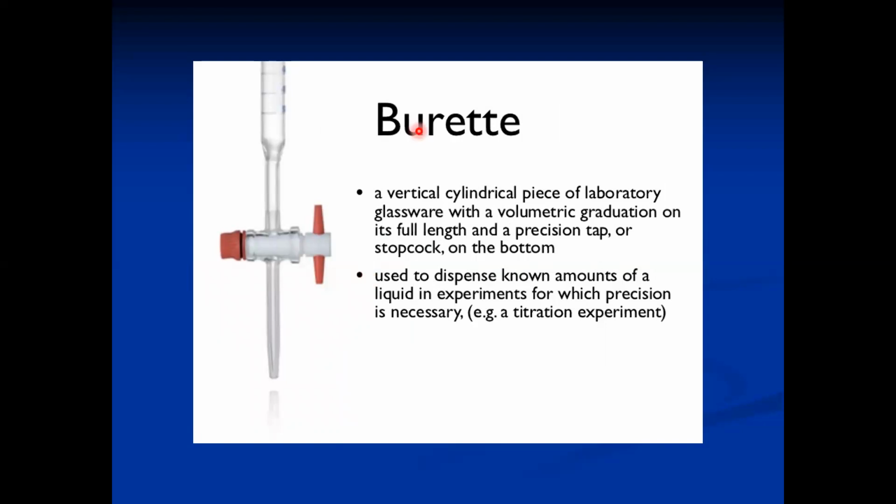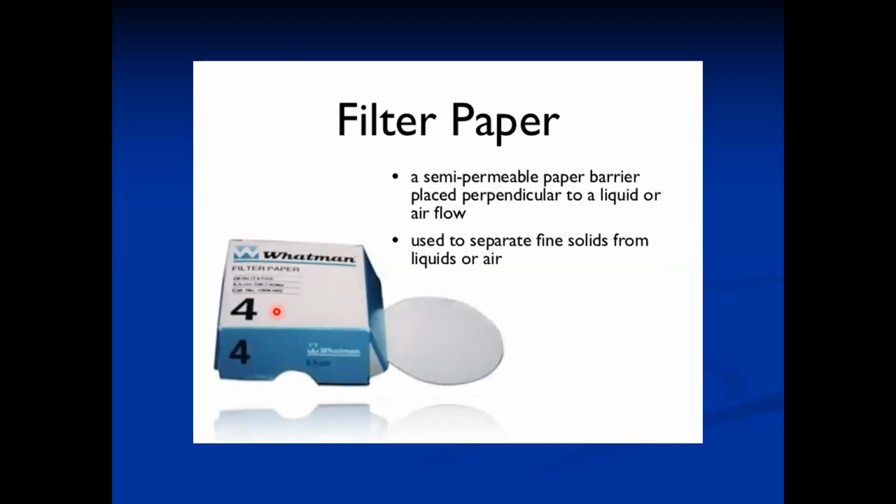Burette, it is also a common glassware within the lab. It is used to add measured quantities of liquid to any other container. Filter papers, used to separate fine solids from the liquid or air.